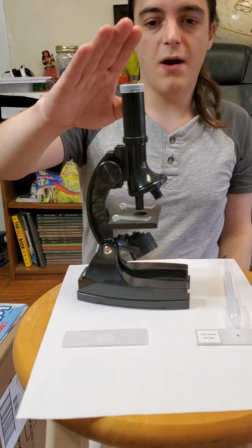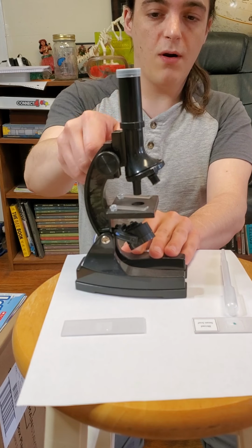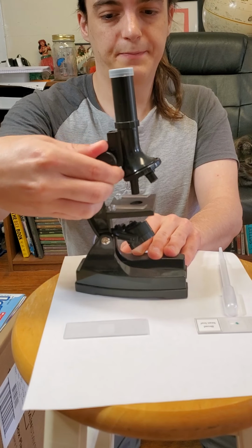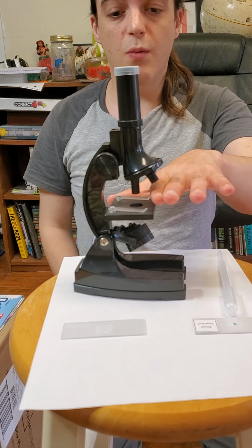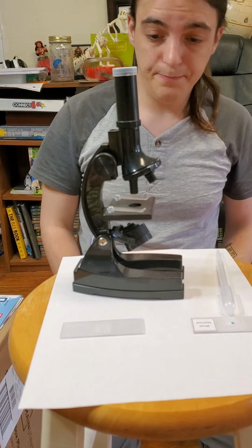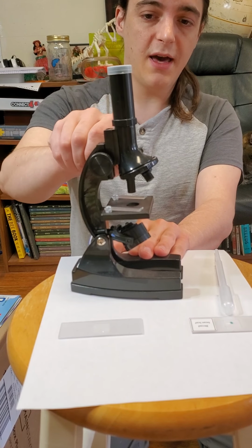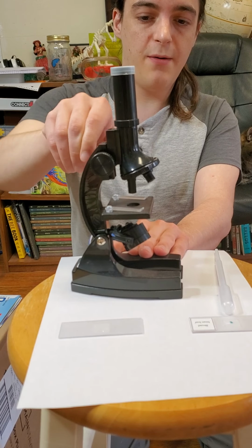So you've got your eyepiece, you've got your different lenses. This is your focus adjuster, the little turny knob right here. Right here you've got your stage, where you're going to put whatever you're looking at under the microscope. This is the arm that holds it all together, so that when you turn the adjuster, it goes up and down.